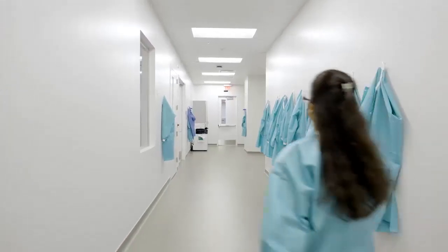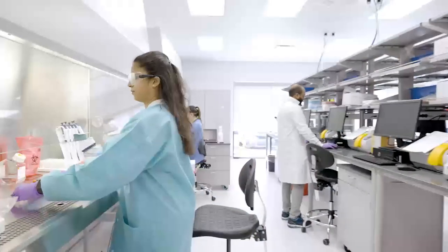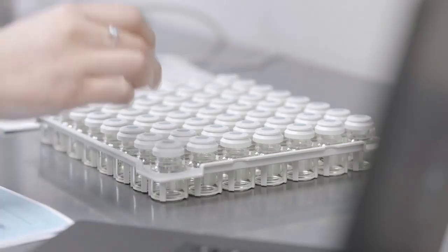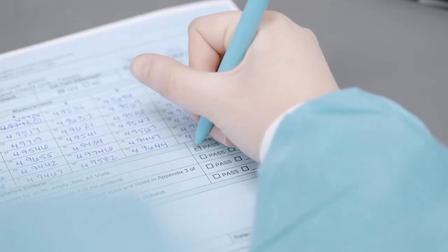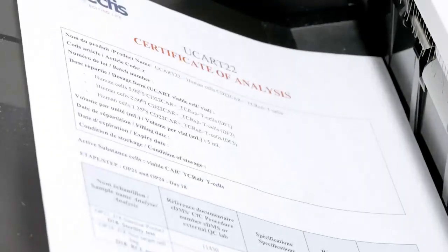At this site, we don't just manufacture, we do manufacturing and testing. During the process, but most importantly, at the end of manufacturing, in order to know that the batch is safe and efficacious, we have to do a battery of tests for release. The certificate of analysis lists all the tests that are required, what criteria they have to meet, and what results did you get. So after QC does the testing and assembles all of that information in the certificate of analysis, QA will review that and determine that the batch is acceptable or not, and they will release the batch for use. So it can't go out the door unless it has been tested and passed all of its quality control tests. If we don't have the QC tests that show that we meet the requirements of the certificate of analysis, we don't have a product.